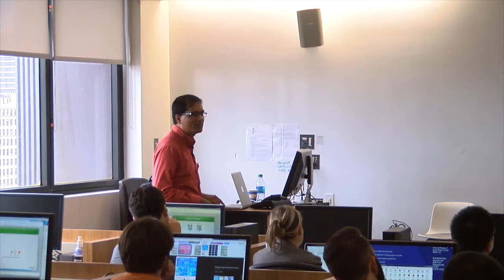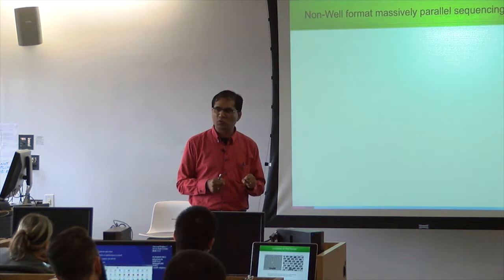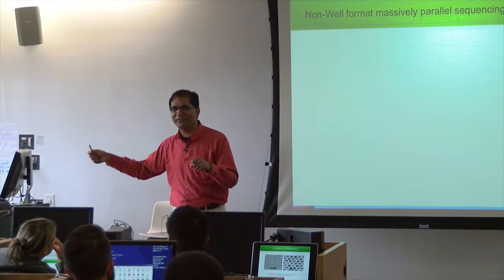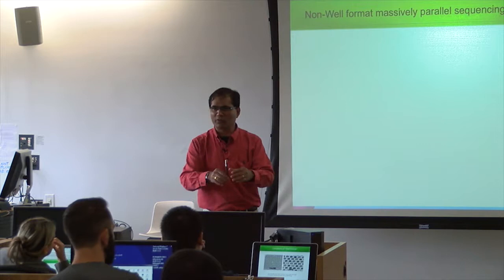So the guys at Solexa earlier, the technology is there. They said, why can't we remove those wells? If you look into the fields, has anybody gone anywhere in the southern part of the US, and seen cornfields? Or lawns in front of houses? Right? What do you see? All those plants are not in ditches or wells, they are all one after the other. They are layered, right? In the lawn outside also, you layer. The grass is layered, right?